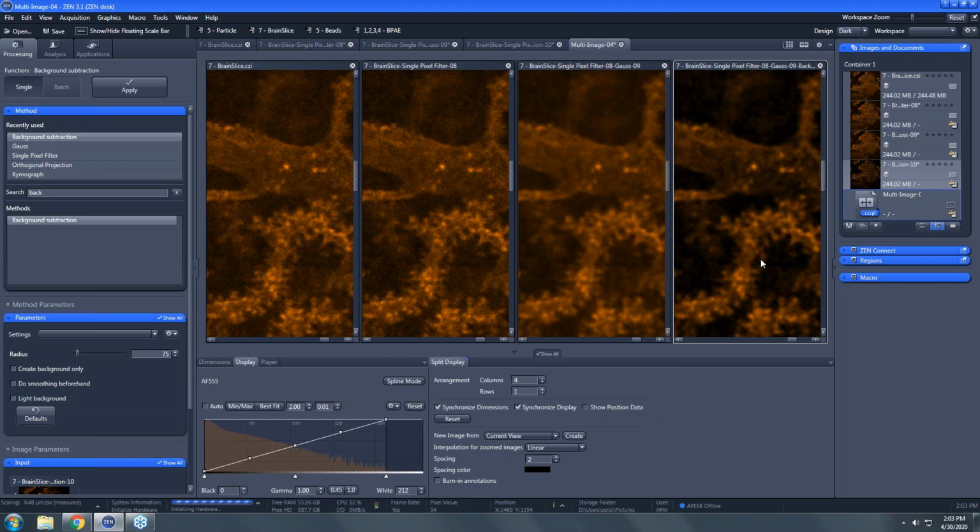That's not going to change the resolution. That's a whole one hour discussion about resolution versus digital resolution versus interpolation itself. But you can't measure anything that you couldn't measure before. It just looks a little smoother, a little nicer. So, okay, hope that answered it. Good. No concern about data, I guess, is the take-home message. You're never going to modify any measurements or images by using that.